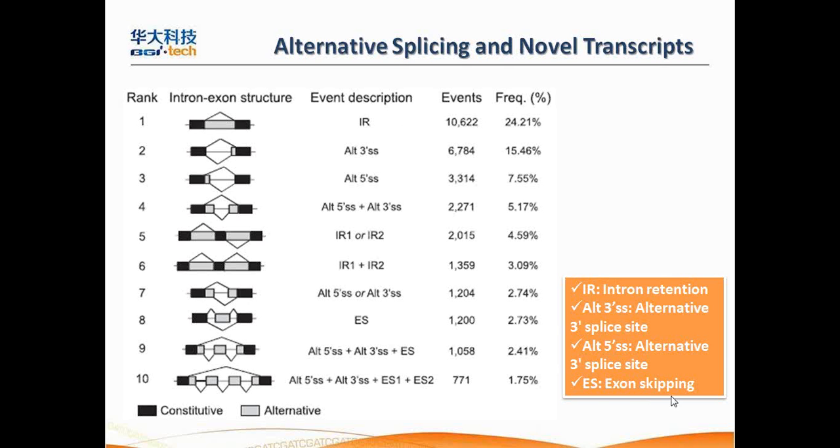This IR means intron retention. That means in some of the isoforms this intron is expressed, and in some isoforms this is removed from the mRNA.